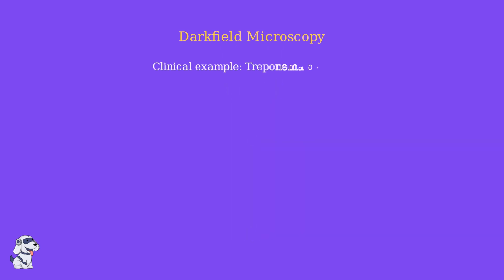This method is perfect for detecting the syphilis-causing spirochete, a delicate organism that is notoriously difficult to stain or view under standard light.